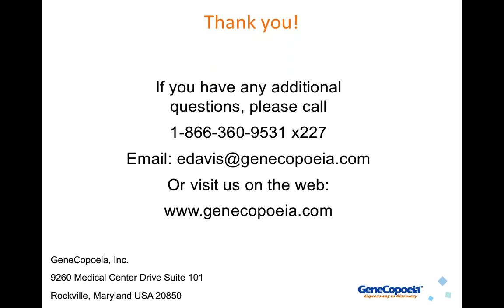It might sometimes be advantageous to use a donor plasmid for getting knockouts, and the reason is that NHEJ mutations are unpredictable, so they're kind of random. But if you wanted to make a very specific deletion, for example, then you would want to design that with a donor clone. And also, donor clones give you the benefit of selection, which NHEJ does not.